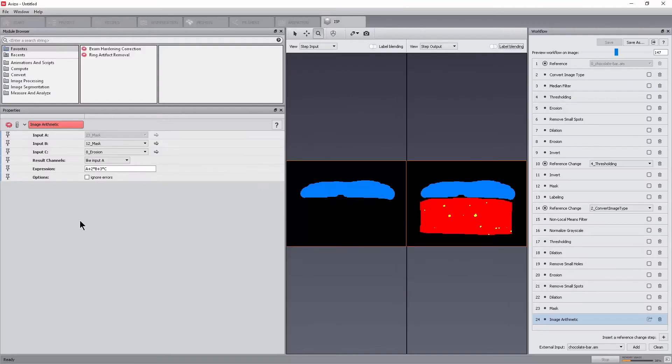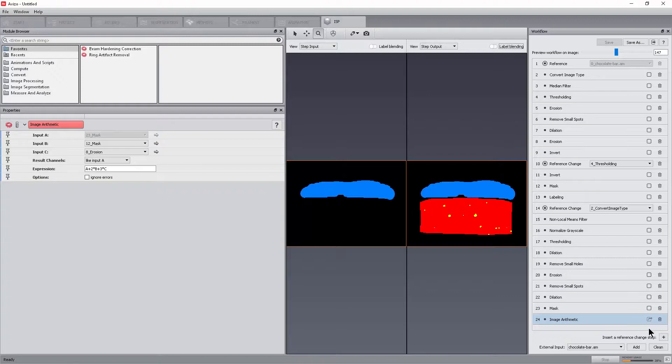Let's export multiple outputs of the candy bar data. By default, only the last step of the image stack processing workflow is exported as final output from the image stack processing module. It is represented by the output icon. To export additional outputs such as the caramel and nougat phase, click the output icon.